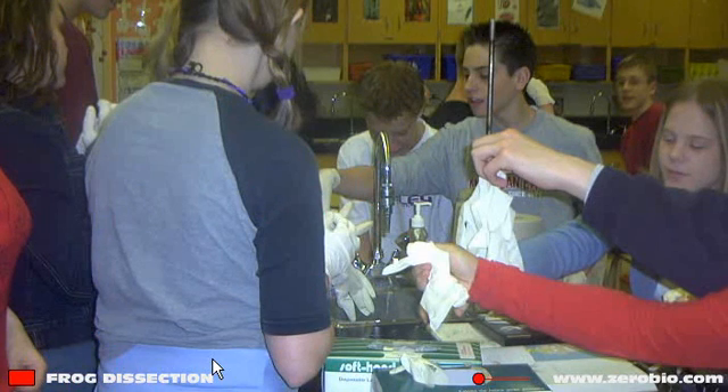When you first go to start your dissection, you're going to want to pick up your gloves — there are some boxes of gloves that will be available for you.